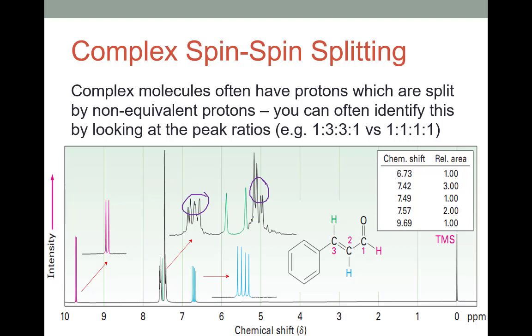In the middle of that, we do see the vinylic proton in green and in blue here. Those are really highly shifted, right? Normal vinylic protons wouldn't show up quite this high, but especially the green one is in between an alkene, or participating in an alkene group, and one step away from this aromatic ring. So it is shifted quite high. The blue one is shifted higher than we'd expect by virtue of being close to this aldehyde group. And so we're shifted to the left here based on what even we would see in our table.